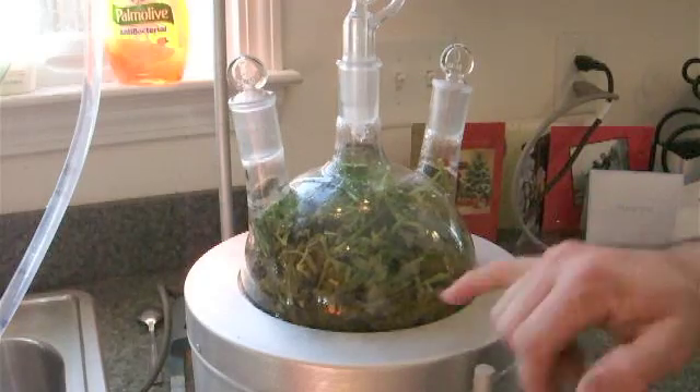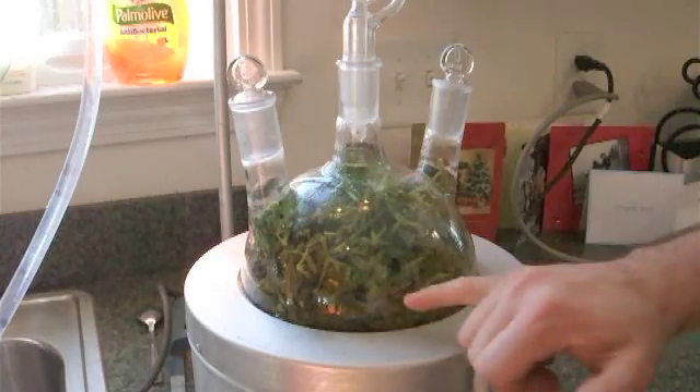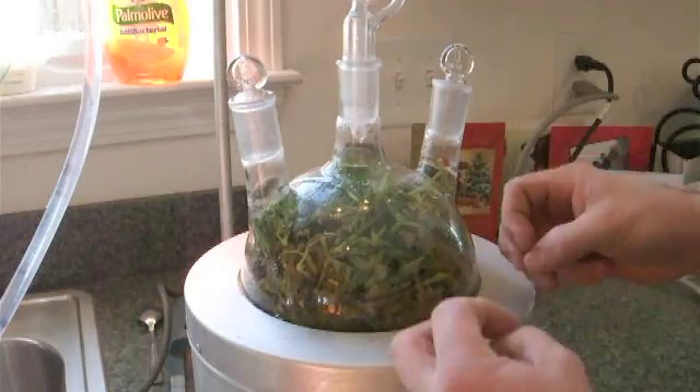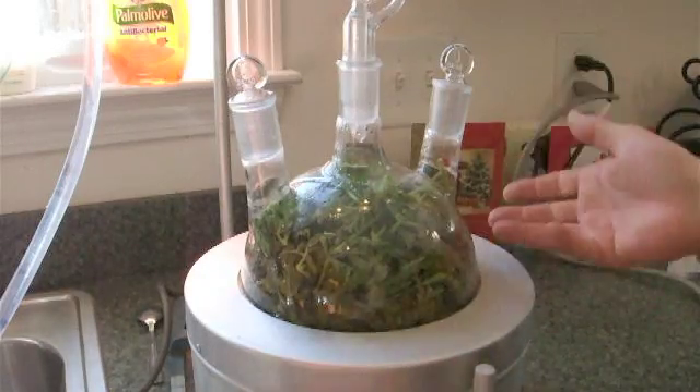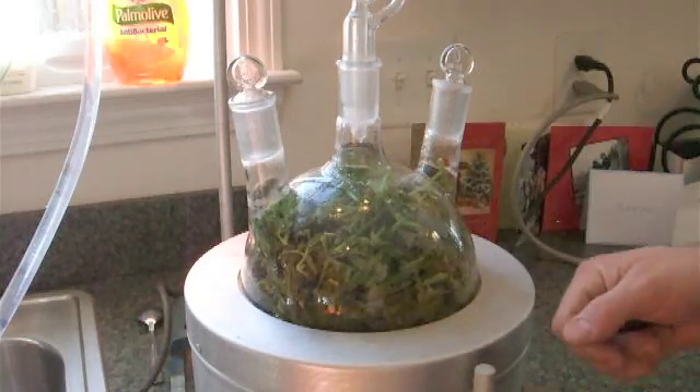It's starting to boil here and you can see that the geranium is going from a bright green to a brownish kind of color as it breaks down and releases its essential oils — and other materials inside the leaves break down too.